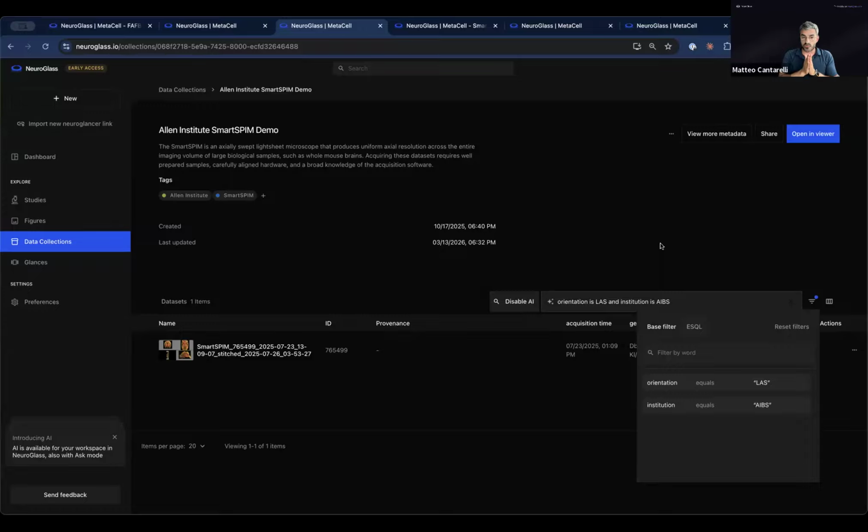We are adding more features, like the ability to comment, like you would on Google Docs, in the image, and tasks, such that anything you need to do on a particular study as a team, you can task other people to do. But to go through this, we have Saya, who will take over. Matteo.